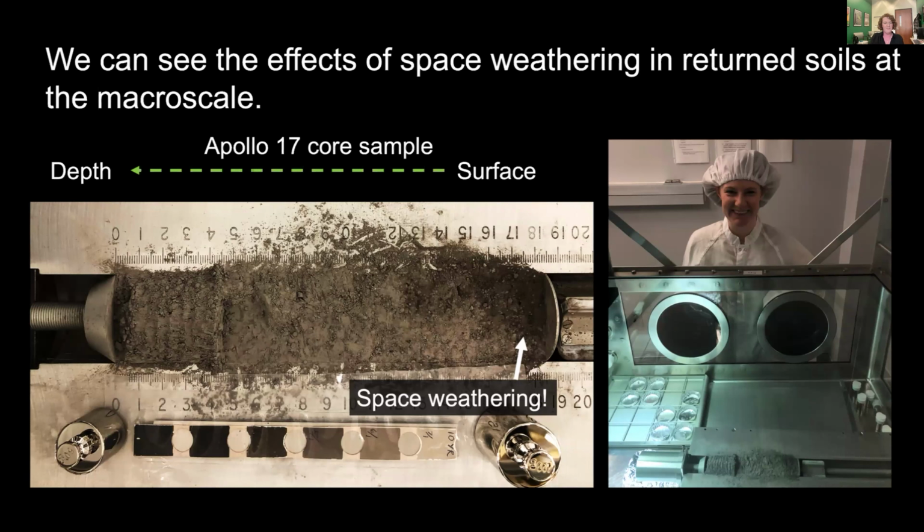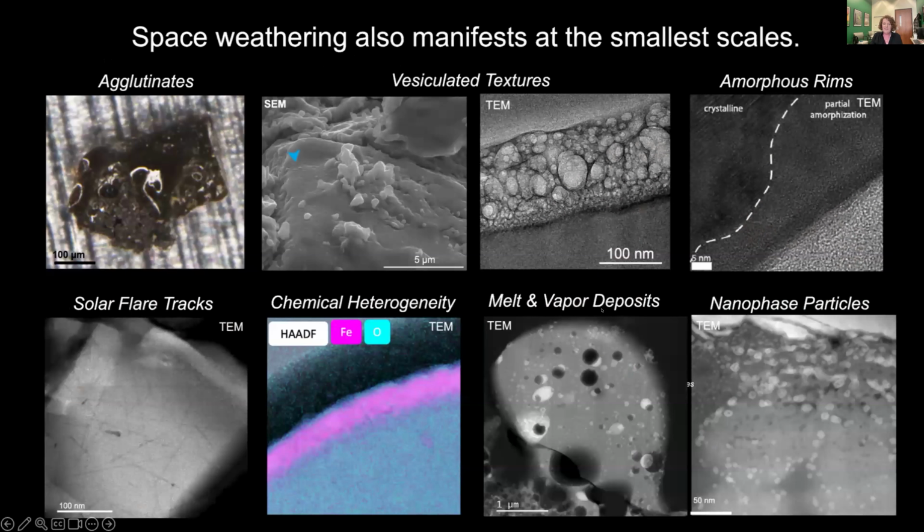Okay, so now we know what it's doing to the reflectance characteristics. We can see the effects of space weathering just with our eyes. How do we recognize this process in the samples themselves? To do that, scientists went hunting for the microstructural and chemical characteristics in the soil grains themselves that were driving these changes in the optical and spectral characteristics. And I've got a few of these examples of what these features look like using electron microscopy data.